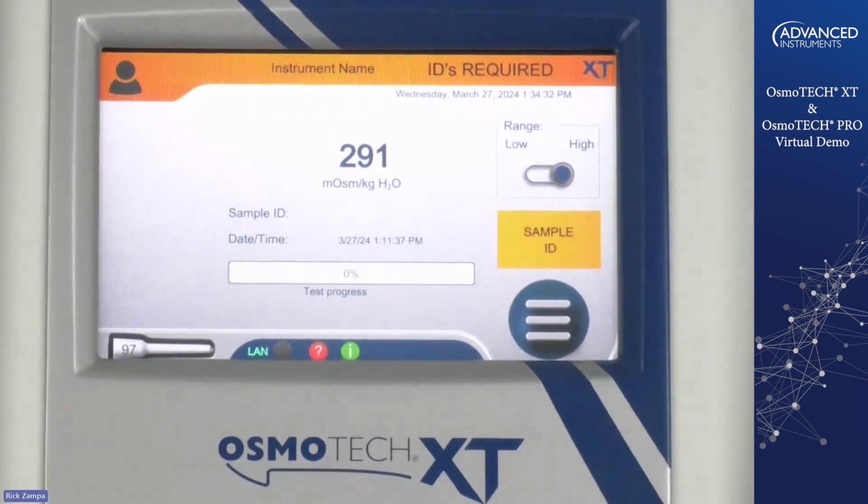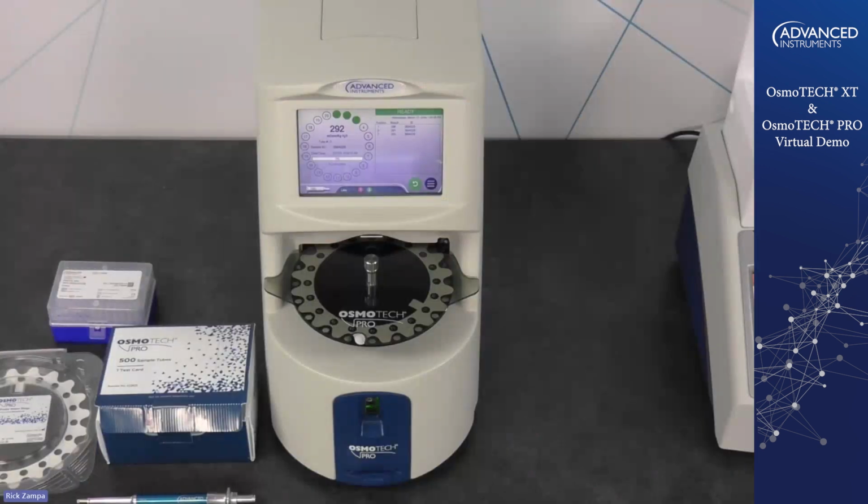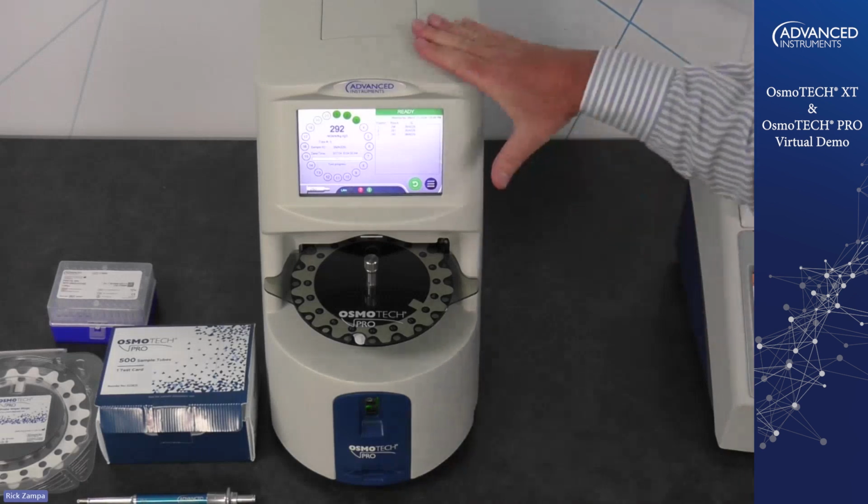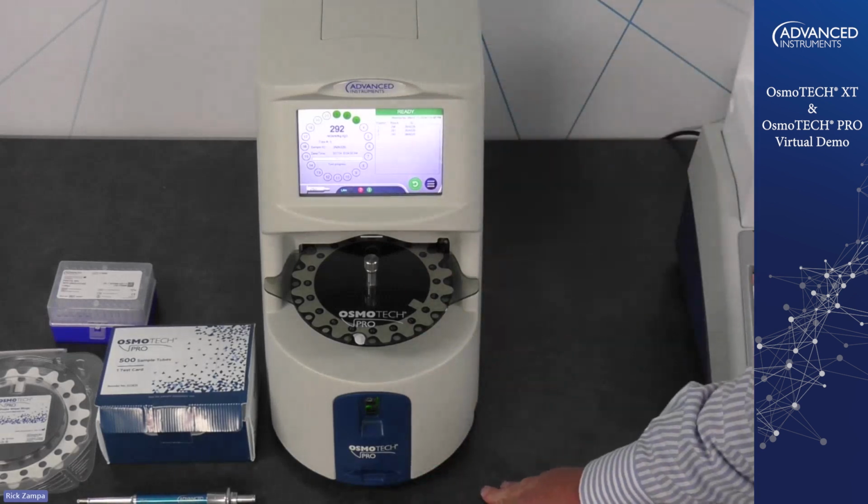Yeah, thank you. I think that's helpful. There are a few other questions. Do you want me to continue, or would you like to finish the Tech Pro and come back to it? Let me jump over to the Tech Pro, and then we'll come back to questions, because I don't have a lot to do on the Tech Pro, since it's very much the same as the OsmoTECH XT. So this is the OsmoTECH Pro. We'll quickly jump over to this unit here. As you can see, obviously a different instrument.